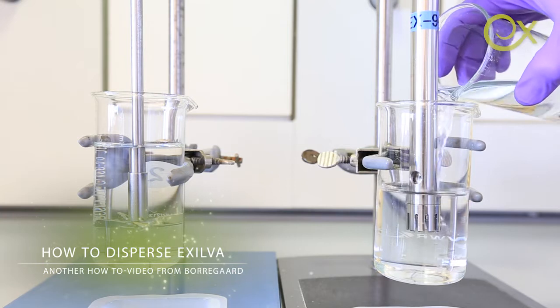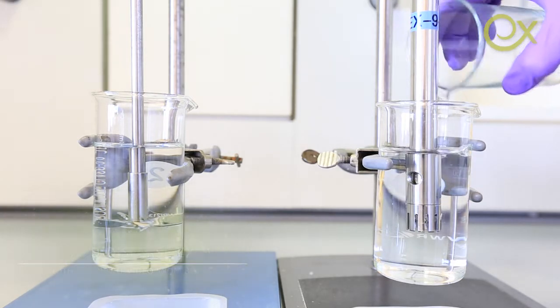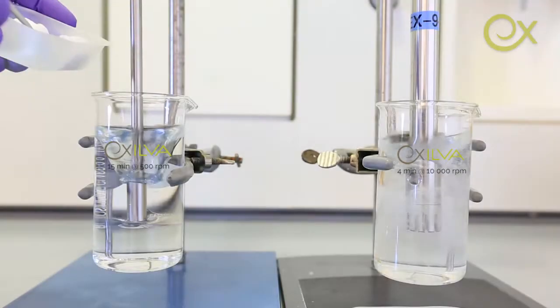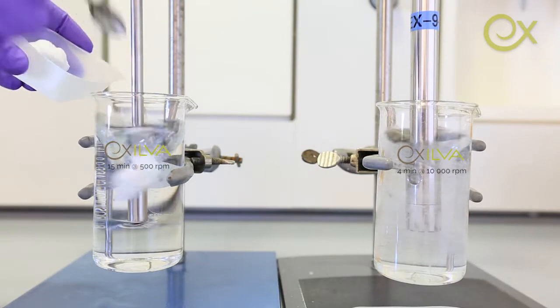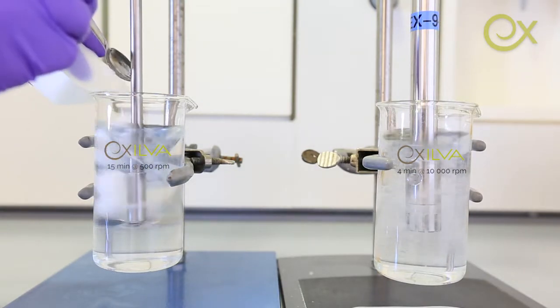How do you disperse Borregaard's Exilva microfibrillated cellulose into your solution? The dispersion of Exilva is the key factor to achieve the desired performance from our product.